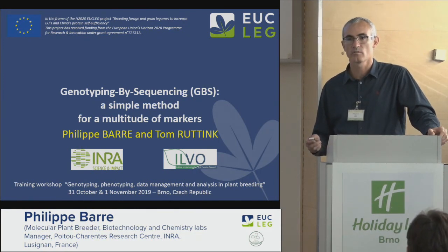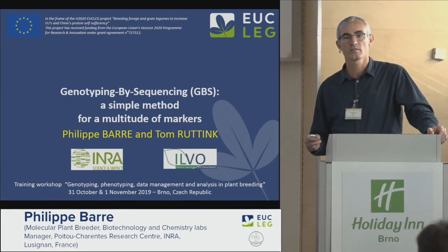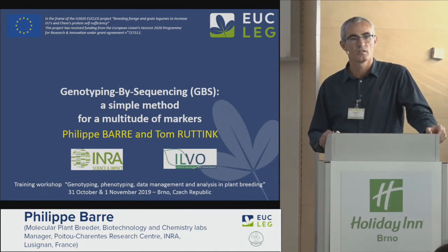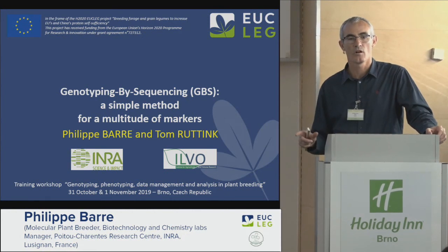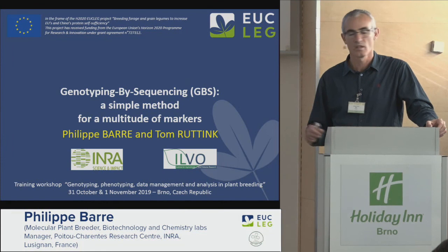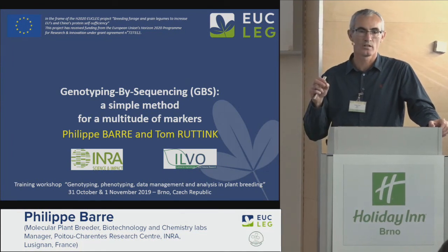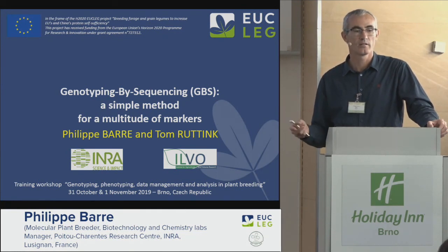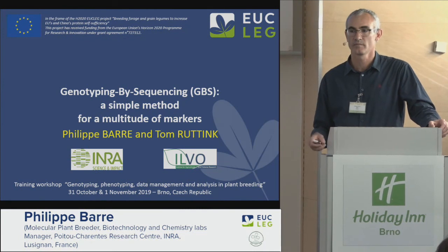My presentation will be in 3 parts. The first one, I will give the general principle of genotyping by sequencing, how it works. Then I will go a little more deeply into how to make a library, and then how to analyze the sequences.